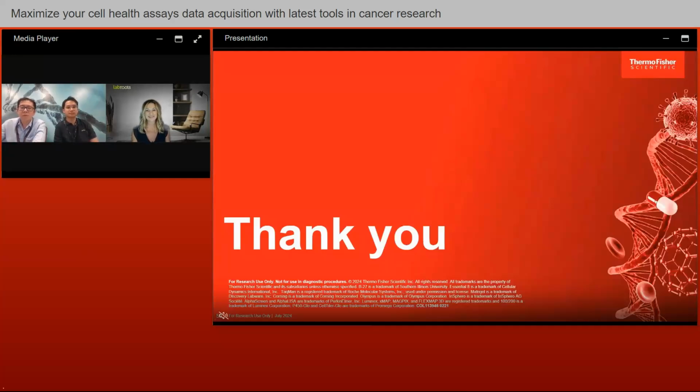Very good, thank you. Our next question. Could you please share more about the microplate reader software? Does it allow for pre-programmed and custom protocols? And what kind of analysis is offered?